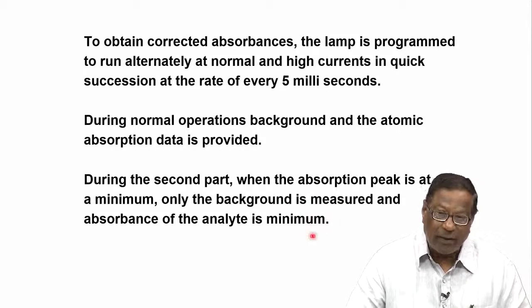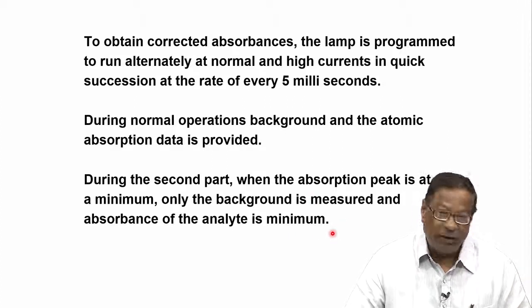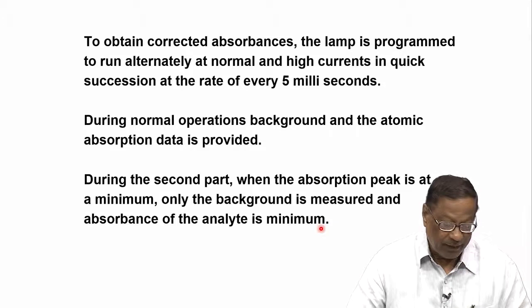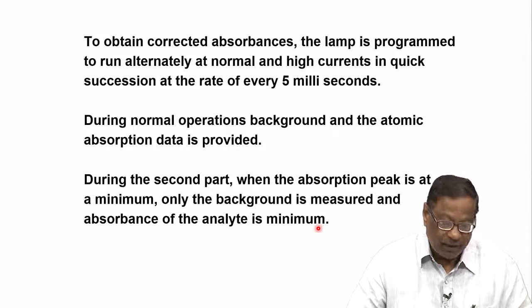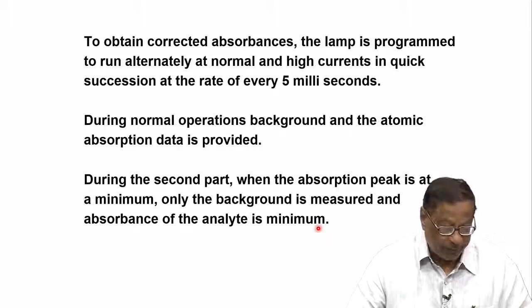This type of correction has come only in the last 20 years. The Zeeman effect has been there for the last 30 years. Hydrogen deuterium lamp background correction has been there for almost 40 to 45 years. But even now these are being produced, and atomic absorption instruments with all three or any one of the three are usually marketed, and you will have to choose the proper background correction whenever you want to buy an atomic absorption system.